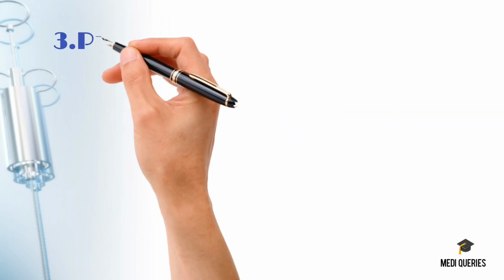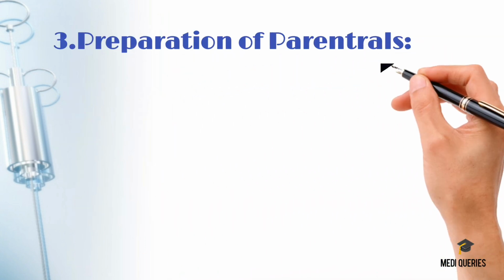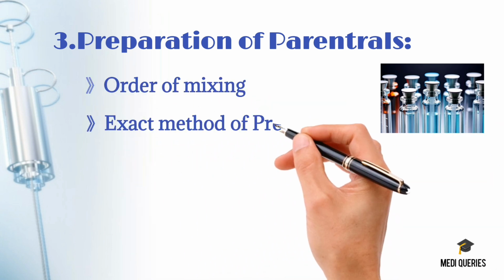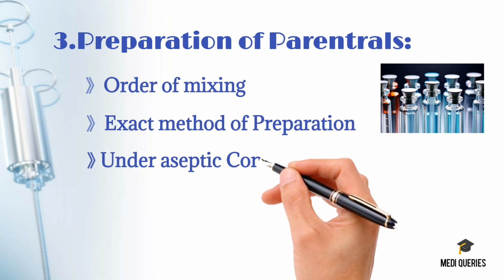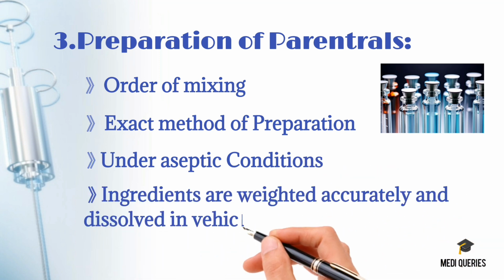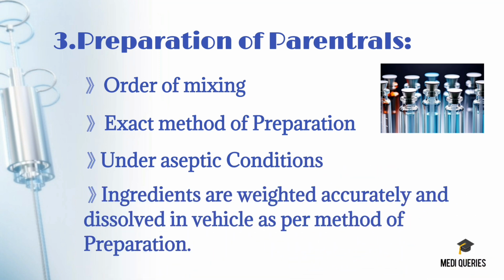After collection of material, the next step is preparation of the parenteral product. Here the pharmacist should decide the order of mixing and exact method of preparation to be followed before preparing the parenteral products. The parenteral preparation must be prepared under strict aseptic conditions.